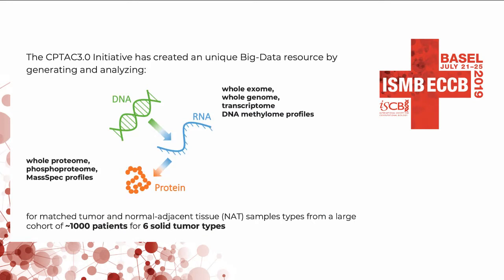This unique big data resource is now in its third iteration, and we have generated and analyzed whole exome, whole genome, transcriptome, DNA methylome profiles, whole proteome, phosphoproteome, and mass spec profiles for about 1,000 patients for 6 solid tumor types.